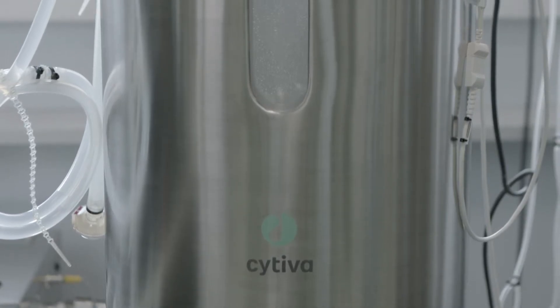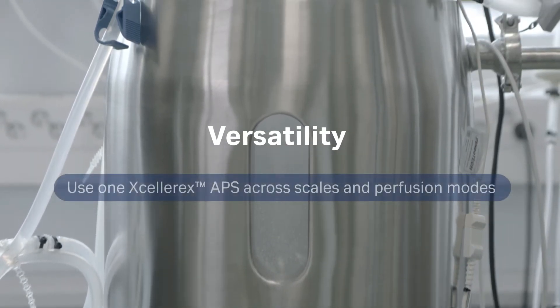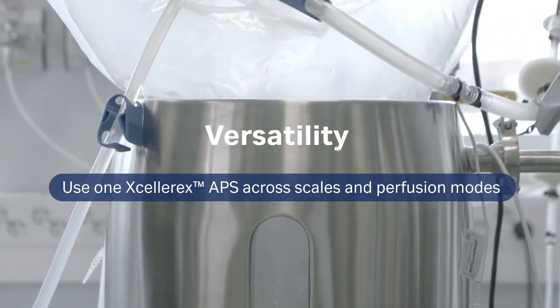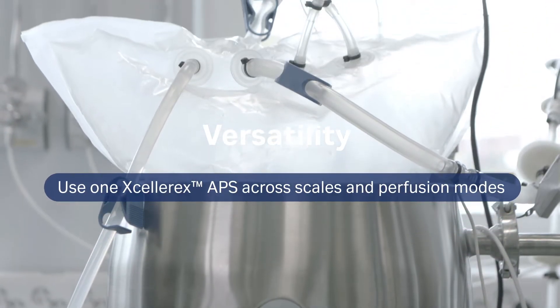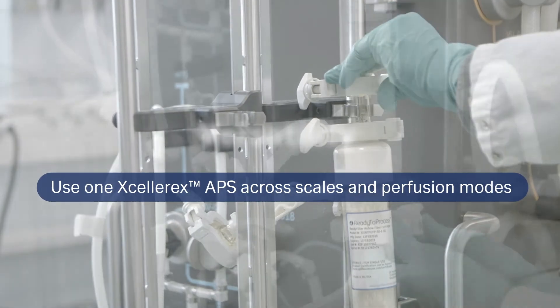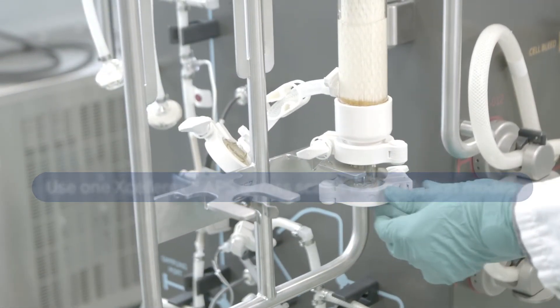Use the Accelarex APS with 50, 200, or 500 liter XDR bioreactors and for a variety of perfusion modes. It's compatible with many hollow fiber filter sizes and types.